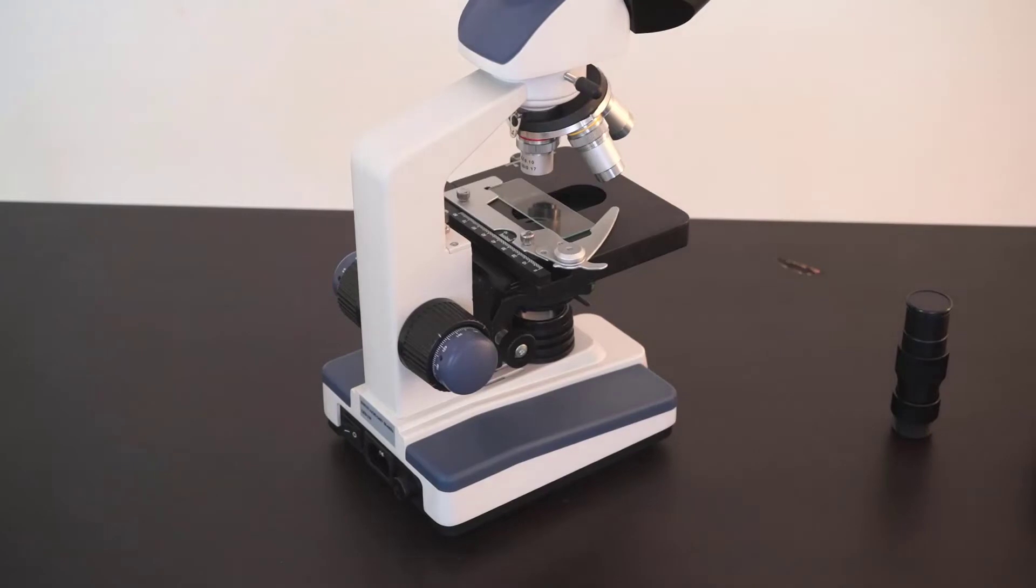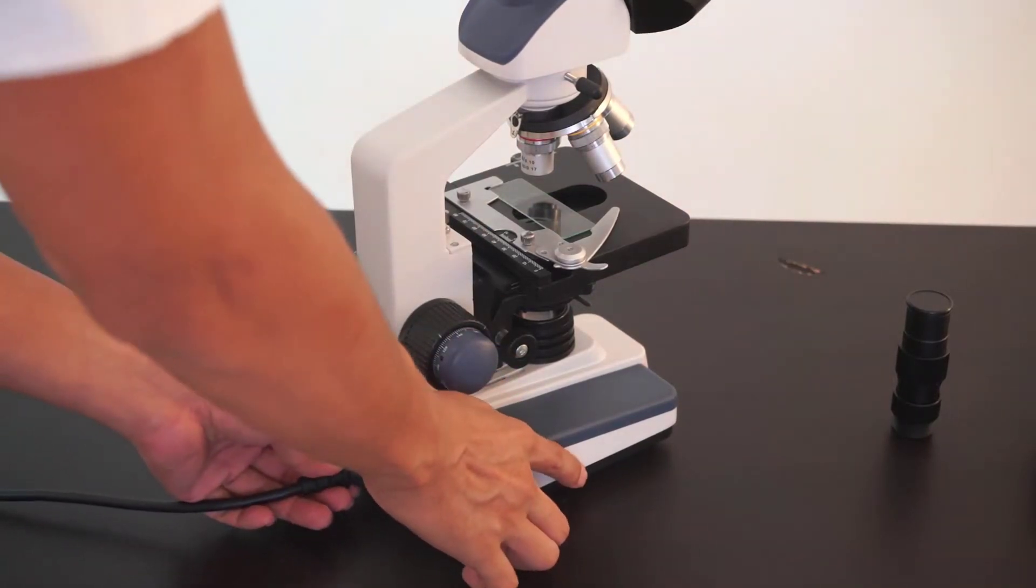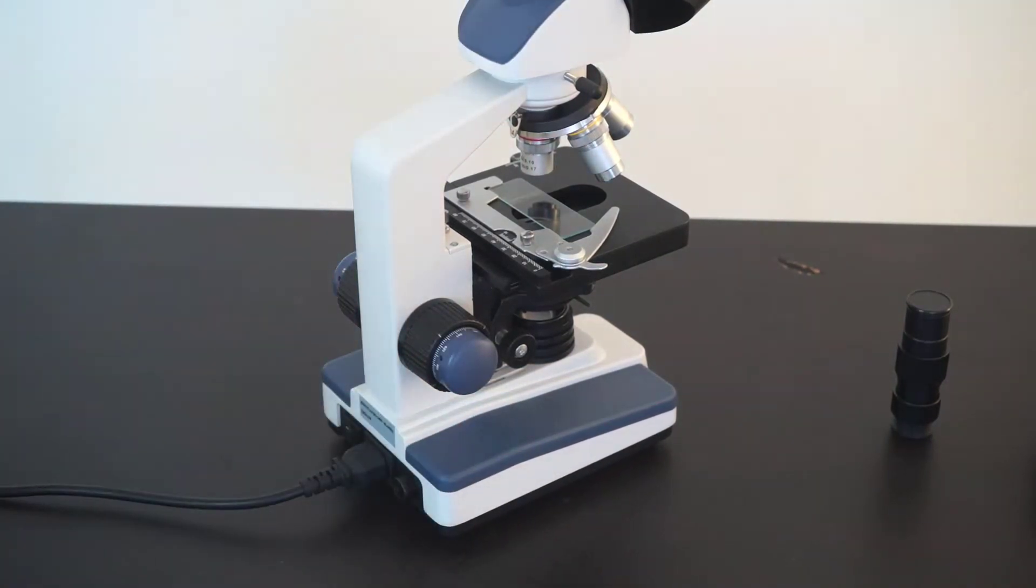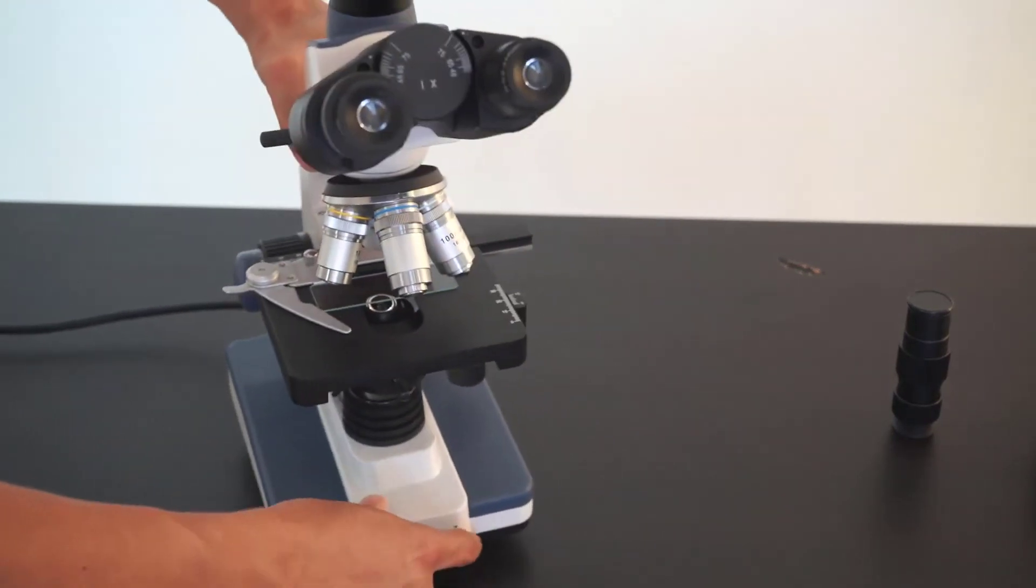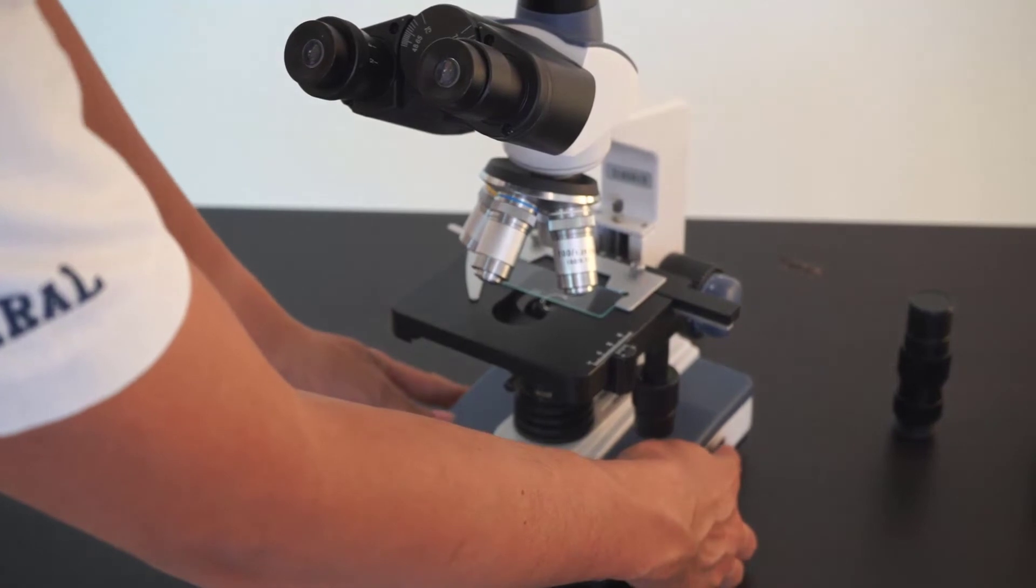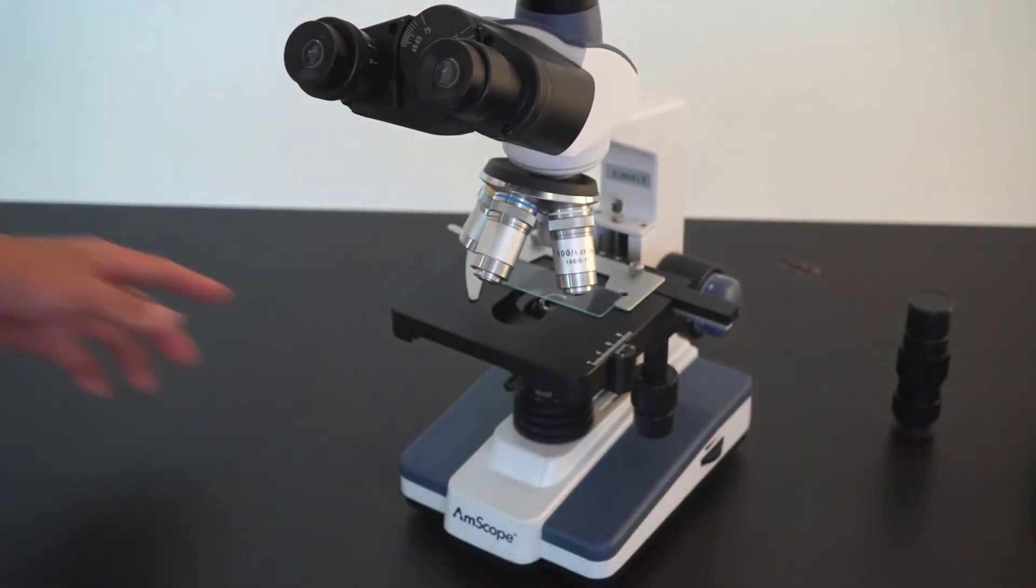To turn on the LED light on the microscope, you can put in the cable and click on the on button. On the side of the microscope there is a knob which you can use to adjust the intensity of the light.